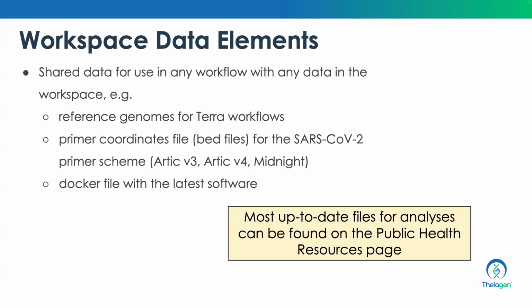So you want to have the same reference, for example, for Vibrio. If you're running Vibrio analysis, you want to have the same reference for Klebsiella or even for SARS-CoV-2, just to ensure you can compare results across different runs. So this is where you would store such references within the workspace data elements.